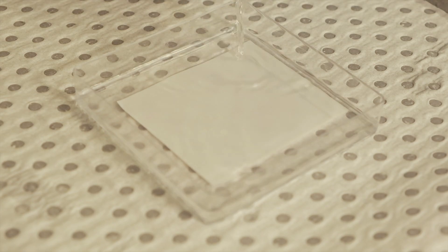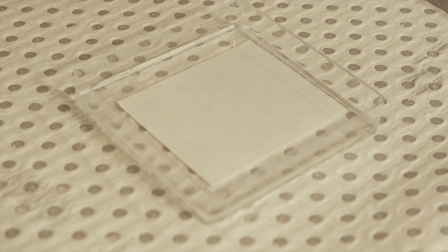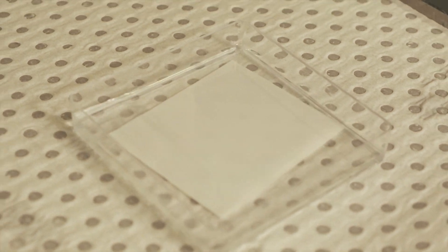Let's take a closer look at how a Western blot works. We begin with the nitrocellulose membrane which has the separated proteins already transferred on. The first step is to block the membrane with blocking buffer to make sure that any areas which might be sticky are neutralised. This helps minimise any non-specific antibody binding, which would otherwise result in false positives.